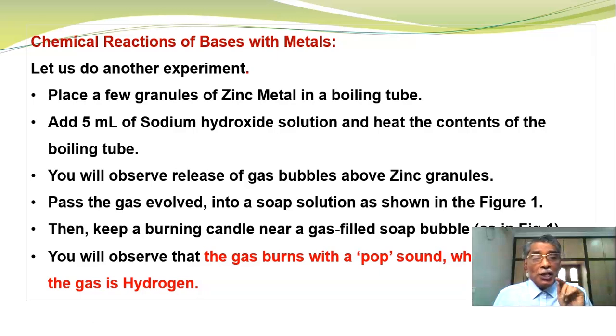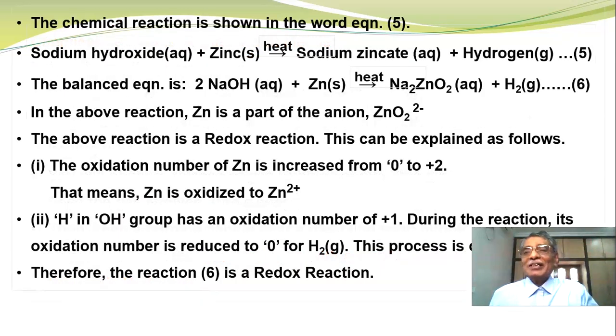Then keep a burning candle near a gas-filled soap bubble. You will observe here also that the gas burns with a pop sound. What is the inference? The inference is that the gas is hydrogen. The chemical reaction is shown in the word equation.